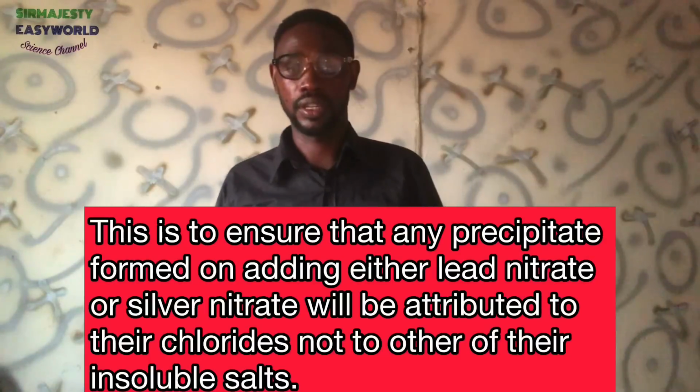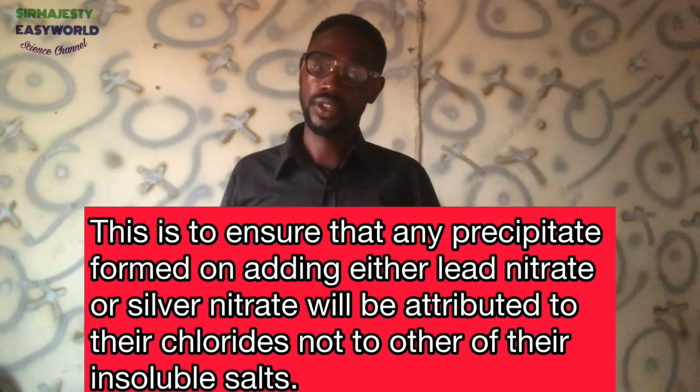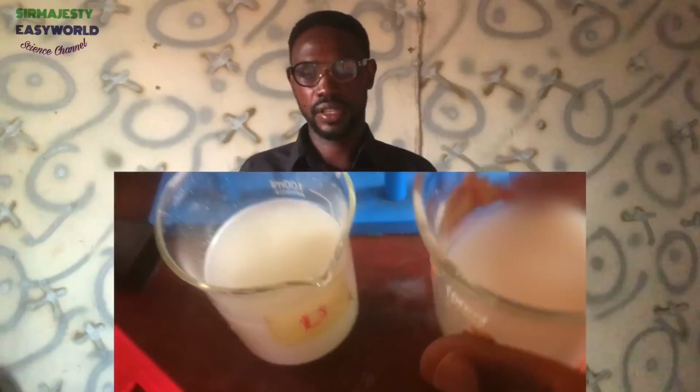HNO3 cannot dissolve chloride ion, of course, but it will dissolve carbonates, because silver carbonate is insoluble. Lead-2 carbonate also is insoluble. So in case of silver nitrate, you say HNO3 is to prevent the precipitation of other insoluble source of silver. Then that is just the chemistry behind that.